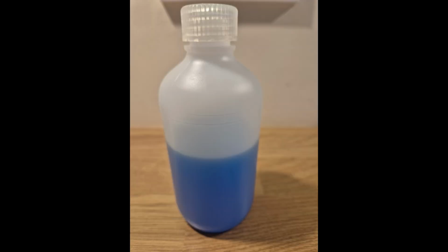Now we're going to do the last test, which is the test for glucose. This test is a bit different as we need heat to activate the Benedict solution before it will change colour. We will do this in a water bath. You could also use a Bunsen burner to heat it. The Benedict that we are using is in a round bottle that is a cloudy white colour. The colour of Benedict is transparent blue.